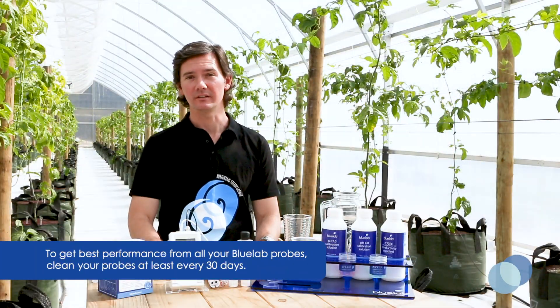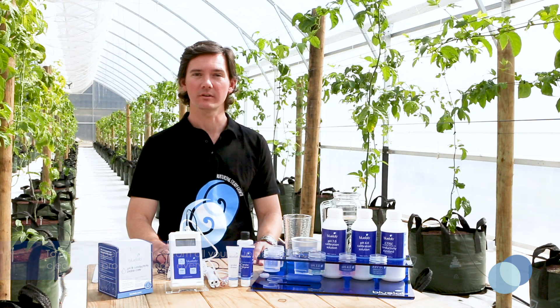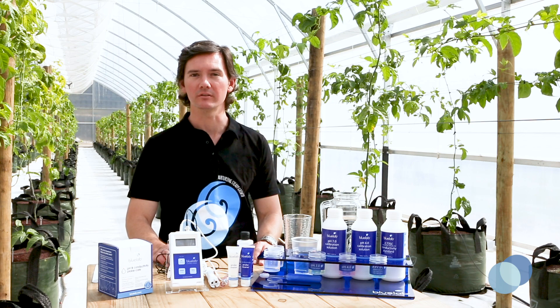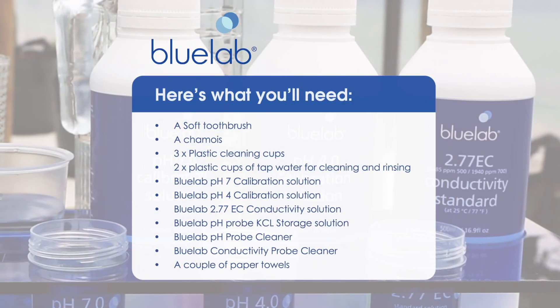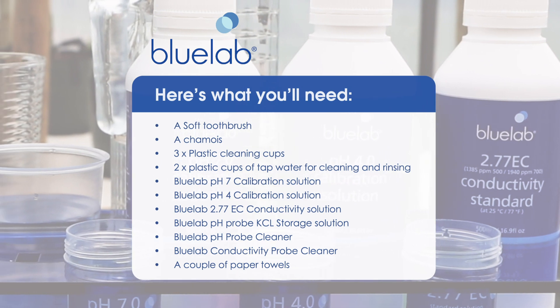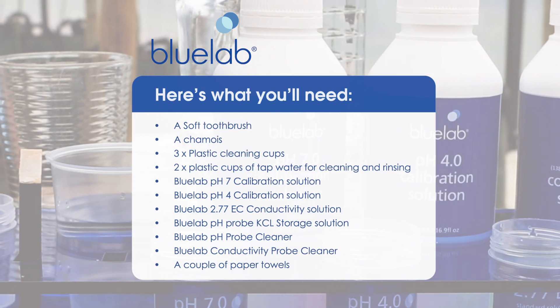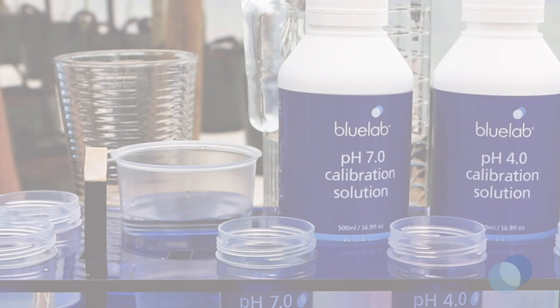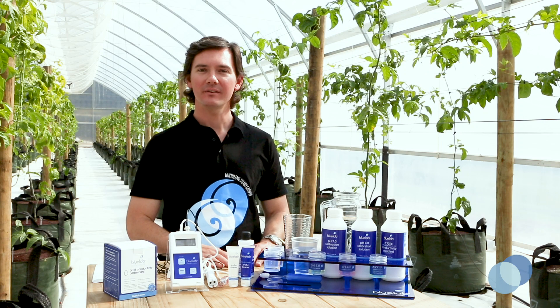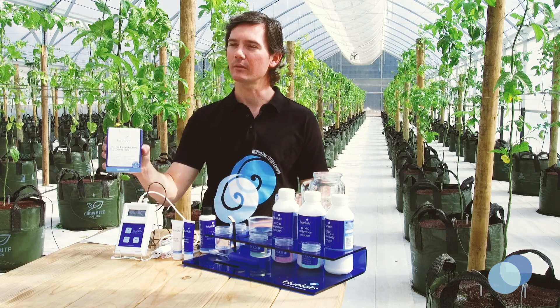To get the best performance and accurate readings, you'll need to clean your probes every 30 days. You'll know it's time to calibrate when the calibration indicators have disappeared from the combo meter screen. Bluelab pH and Conductivity Probe Care Kits contain everything you need to clean and calibrate your probes.